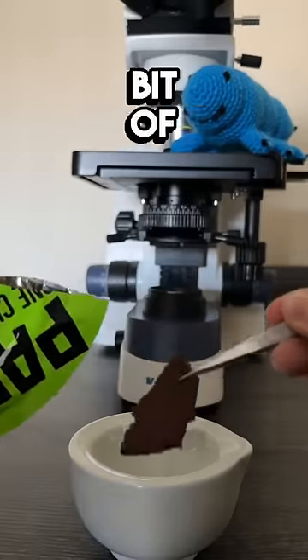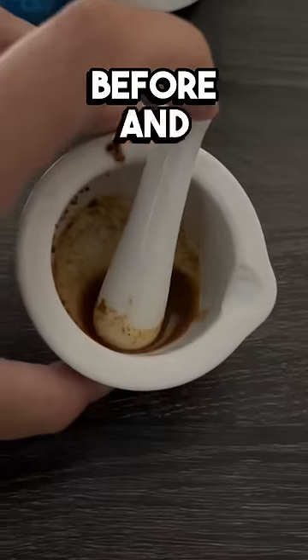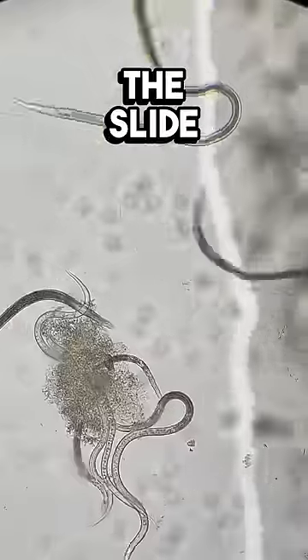I did have to add a little bit of water and grind it up to make this possible, but I think it's still just as spicy as it was before. And now I'm adding a drop of it to the slide to see what happens.